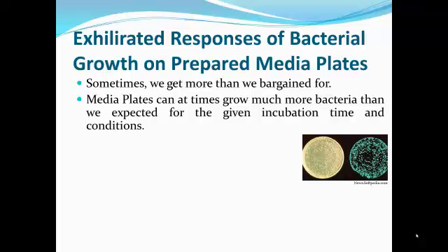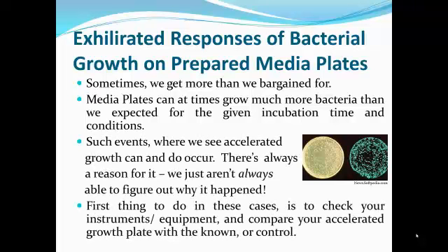Accelerated responses of bacterial growth on prepared media plates. Sometimes we get more than we bargained for. Media plates sometimes can grow much more bacteria than we anticipated or expected for the given incubation time and conditions. Such events, where we see accelerated growth, can and do occur. There's always a reason for it. We just aren't always able to figure out why it happened.